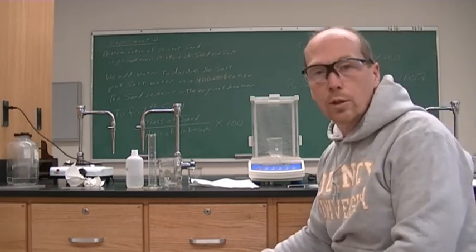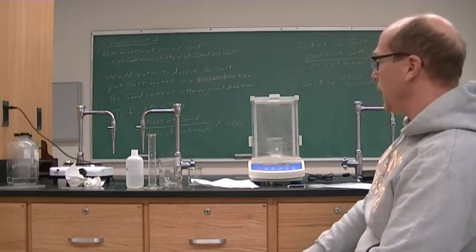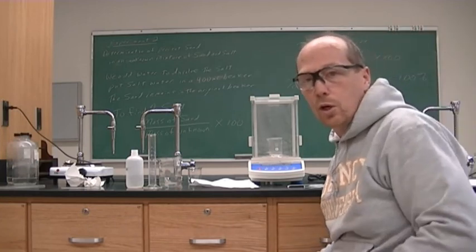We are ready for number three — it is on zero. Our mass is 50.8059. That is all the data that you need for experiment two to find the percent sand and the percent salt.